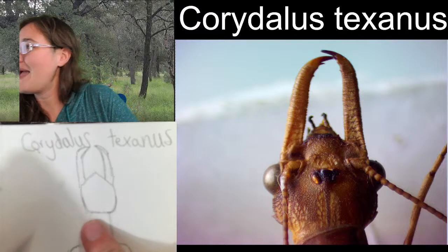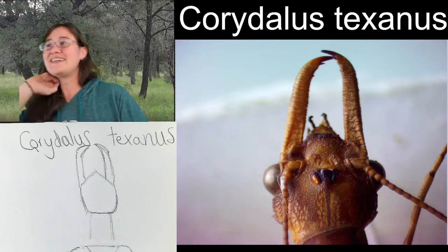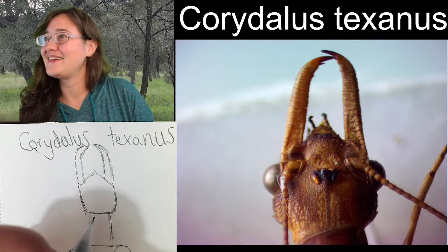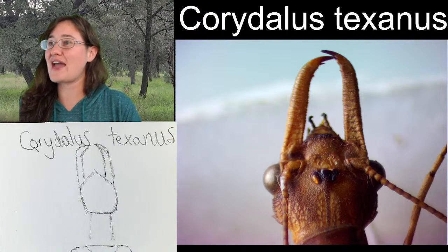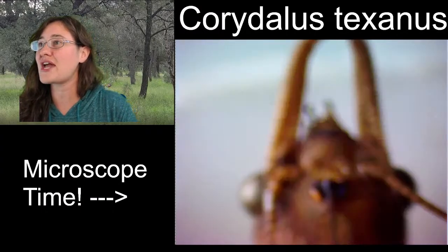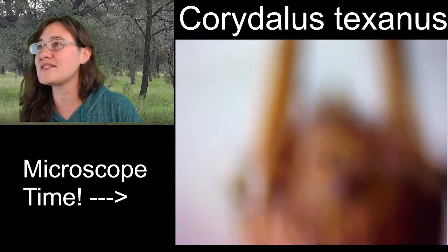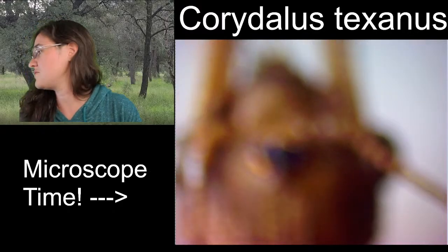Alright, so the back of our... Ooh, we're fancy. Yeah, exactly. I do love the texture on this guy, and we can zoom in even further to really check out some of this texture. If we're looking at, let's say, right here. Oh, not that far, friend.